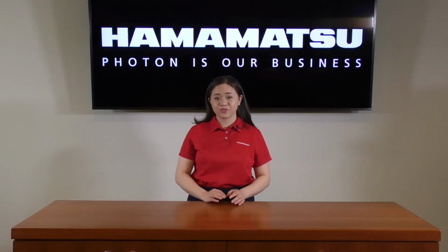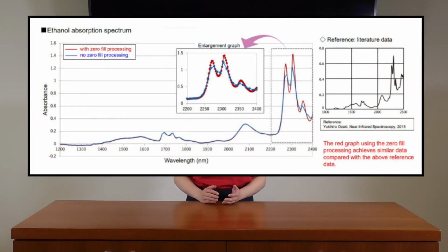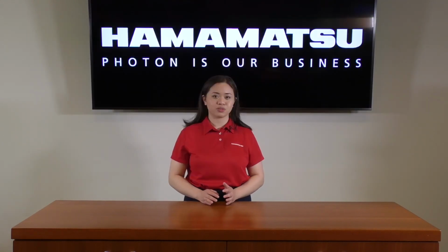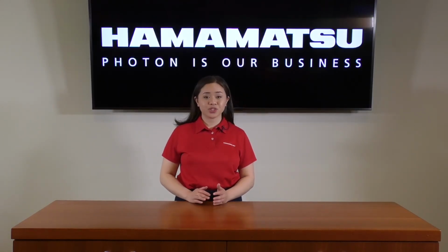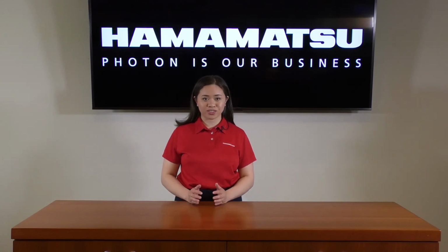For original equipment manufacturers, or OEMs, designing their own instrumentation, we offer a full software development kit, or SDK. This free evaluation software can be used to gather interferograms as well as process them through techniques such as zero filling, which is used to enhance the separation of spectral features. These raw interferograms can also undergo fast Fourier transforms to produce measured spectra.